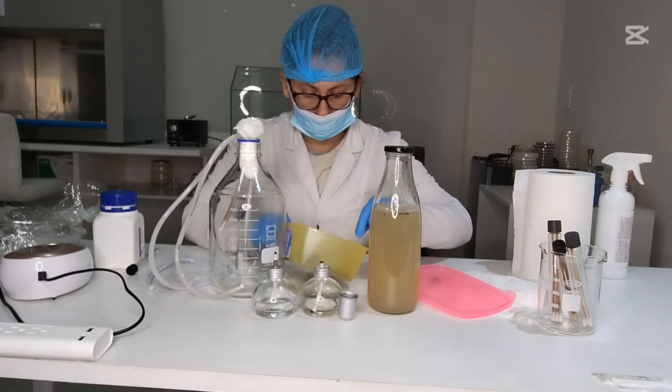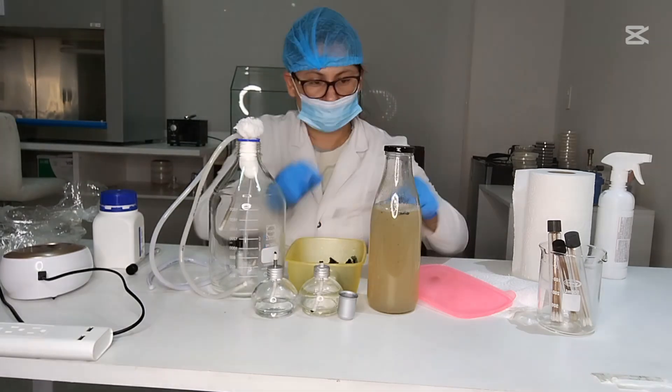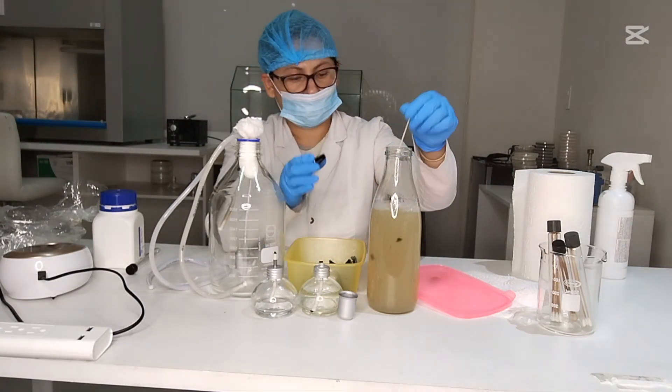Inoculate: add the microbial culture — a small amount of starter microbes — into the medium under sterile conditions if possible.